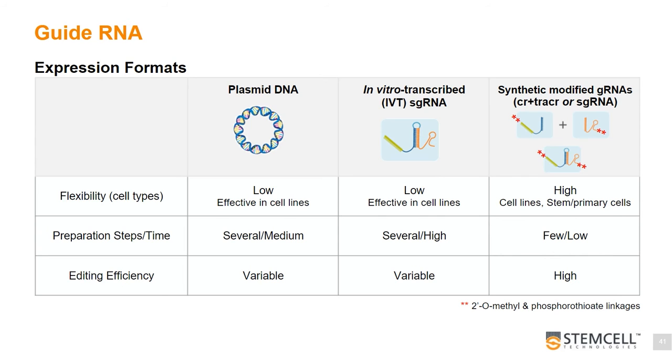However, studies have shown that synthetic modified gRNA are still the best and the most flexible in terms of editing efficiency across different complex cell types. It requires few preparation steps prior to delivery and exhibits higher editing efficiency compared to IVT or plasmid-expressed gRNA. The additional modification to the ends of synthetic gRNA is also critical, as discussed earlier, as unmodified gRNA can be degraded by intracellular nucleases and can activate a cellular immune response.